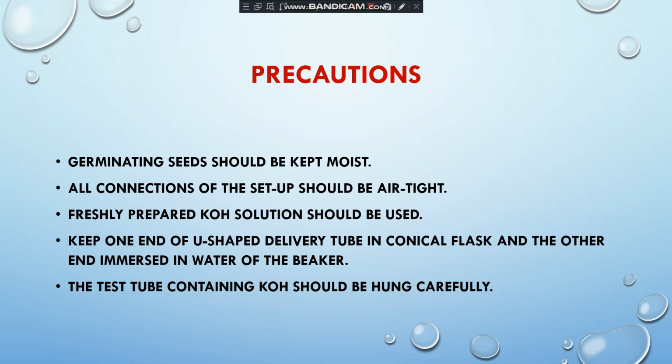It should not happen that the potassium hydroxide falls down in the conical flask, or by chance falls down in between the experiment. So it should be hung carefully in the conical flask. So students, this is the complete experiment, experiment number 1 of biology, and the aim of that experiment was to show that carbon dioxide is released during respiration.